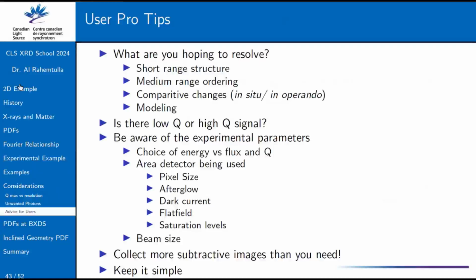And then usually something that's always handy to know is what your beam size is. And then also finally for you guys, collect more background images than you think you need. It's annoying, it's not interesting because it's not sample, and usually everyone has a lot of samples.